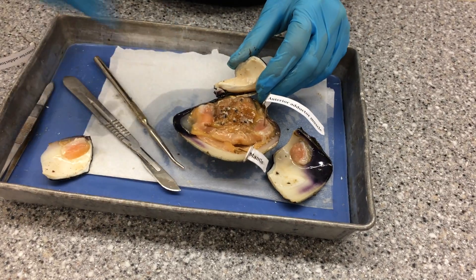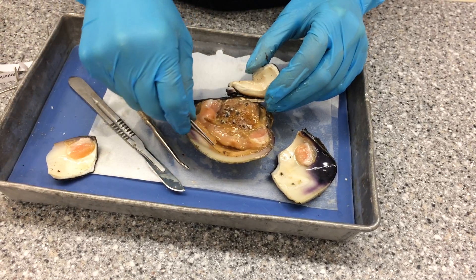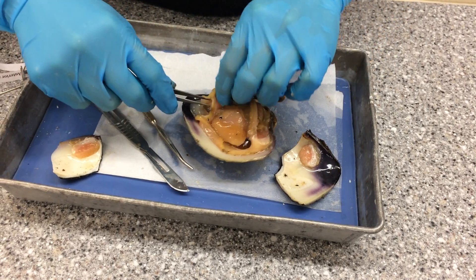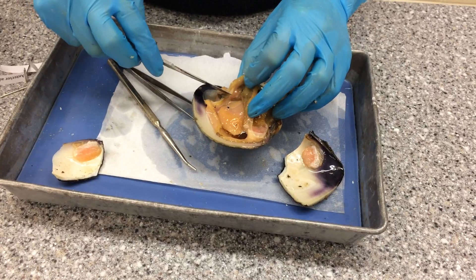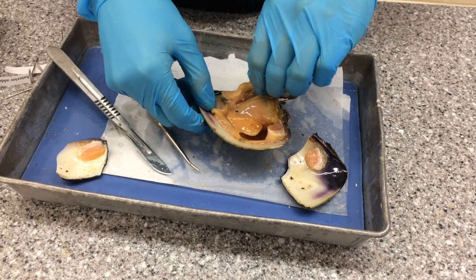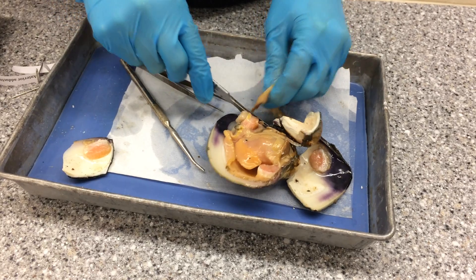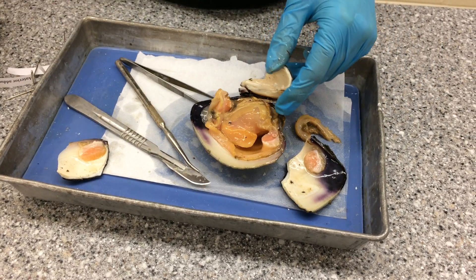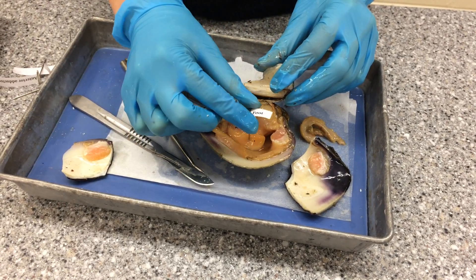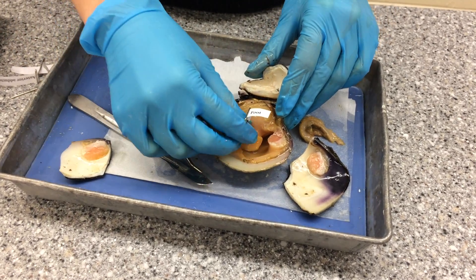Now I will remove these and take off this top layer of the mantle to expose the rest of the specimen. Here we have the foot, and when the circular muscles in the foot contract, the foot extends, and through this mechanism the clam can bury itself in the sand very quickly.